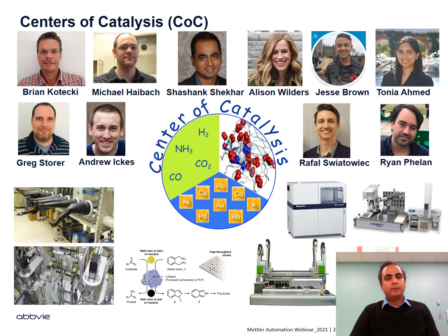Our HT effort within process chemistry started in the Center of Catalysis, but is rapidly expanding into other non-catalytic reactions such as amide coupling, SNArs, as well as solid-state chemistry. So within the Center of Catalysis, we work on metal and enzyme catalyzed reactions as well as reactions under pressure. And the group is very well supported by state-of-the-art HT equipment as shown here, as well as a group of very enthusiastic colleagues, again shown at the top of the slide.